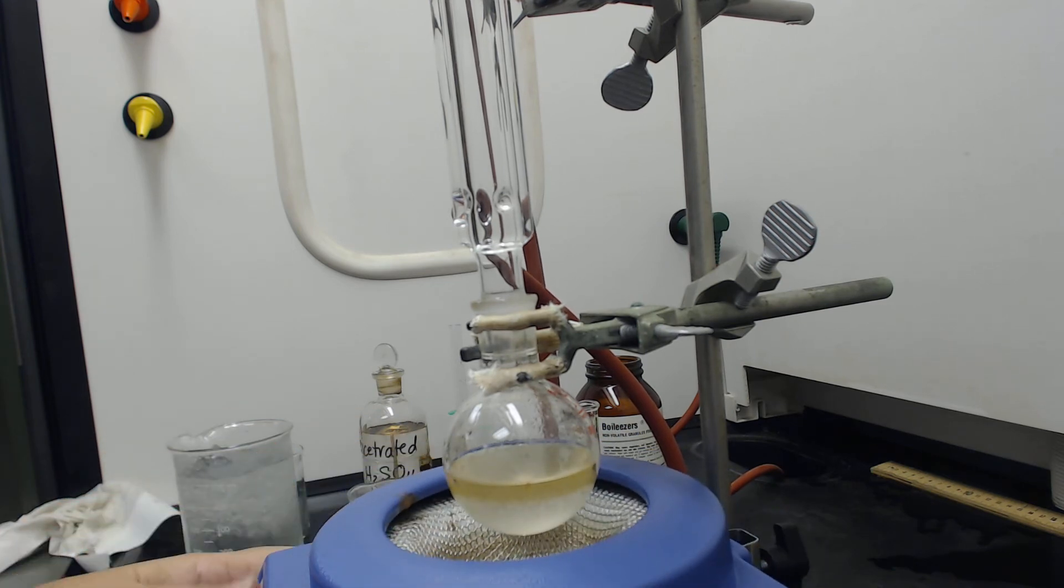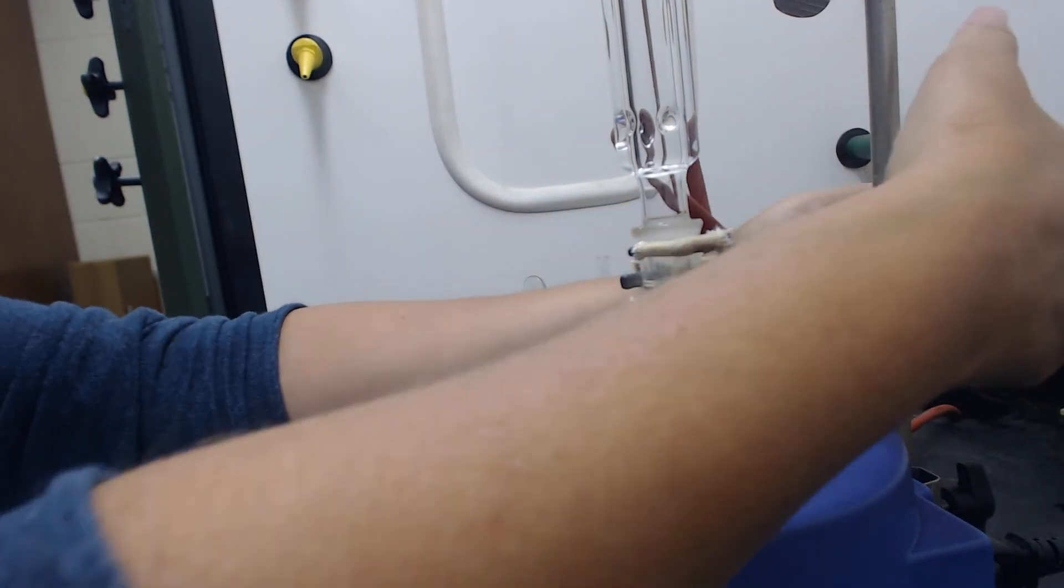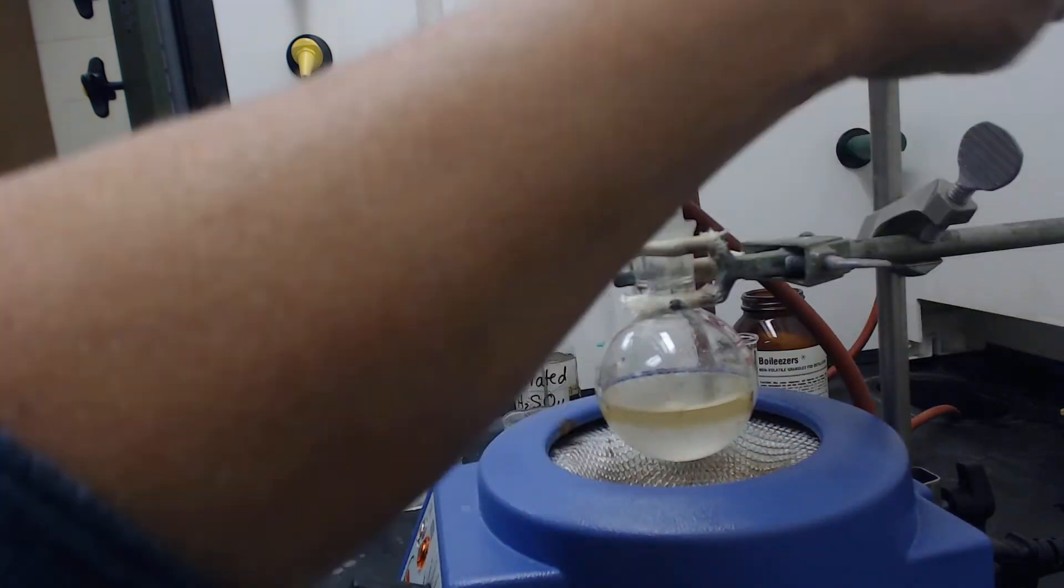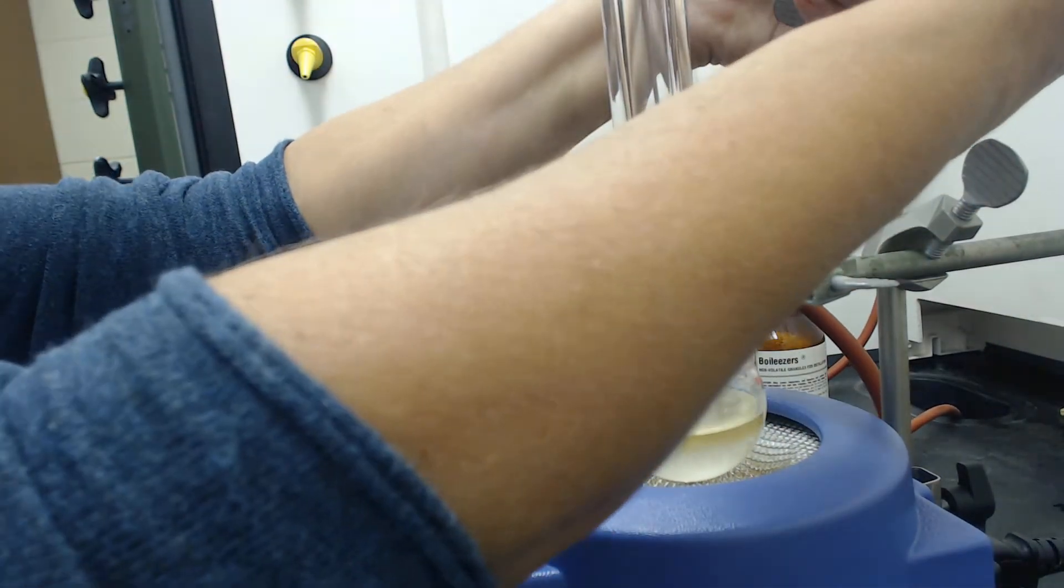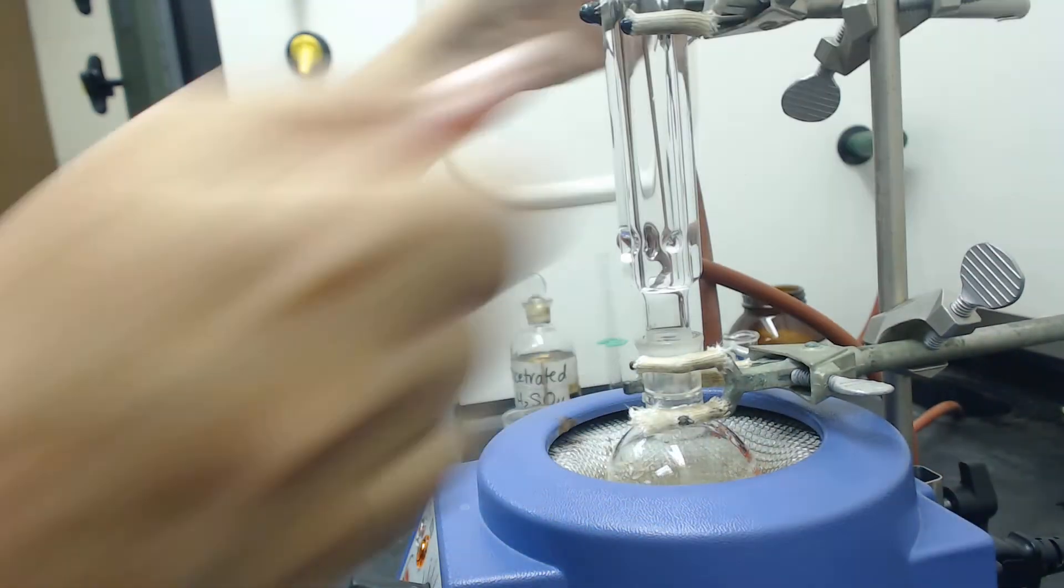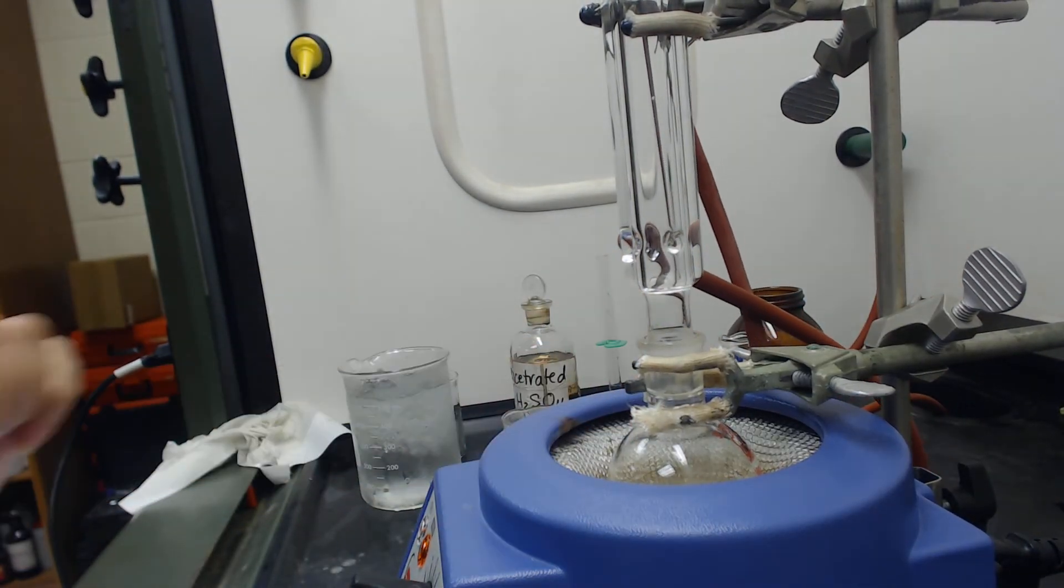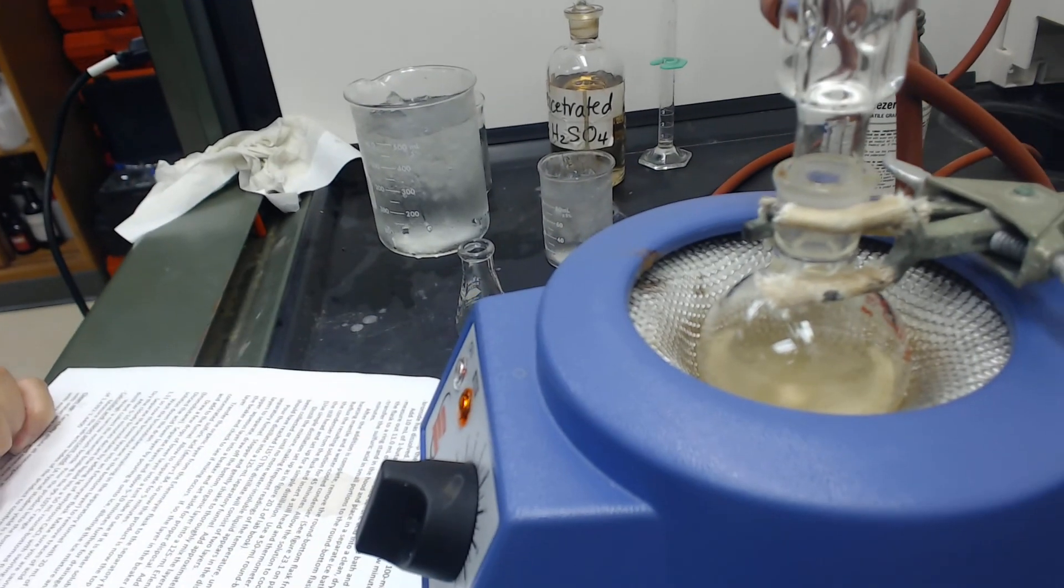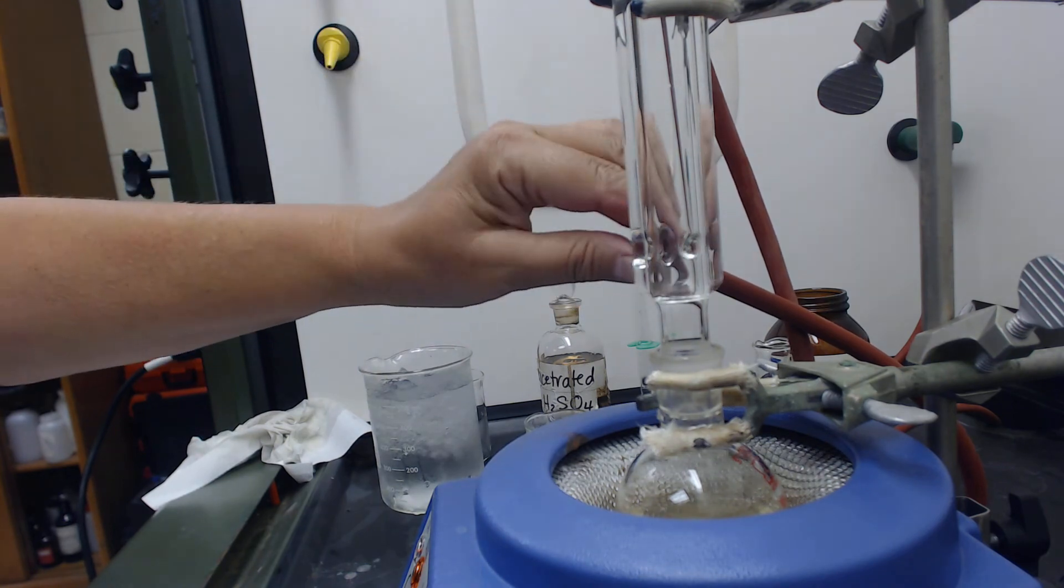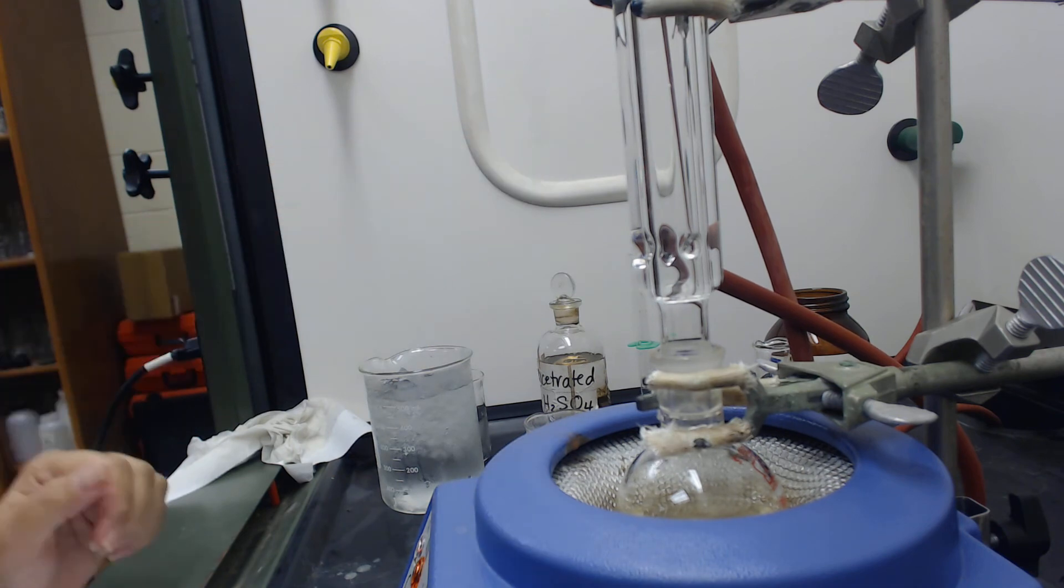What I'm going to do is start my heating mantle. I'm going to have to move this whole contraption down. Now I'm going to clamp it so this is nice and nestled into the heater. I've got the cold water running. The cold water's got to start at the bottom and go out from the top. Now I'm going to just turn on the heater and let it start to boil.